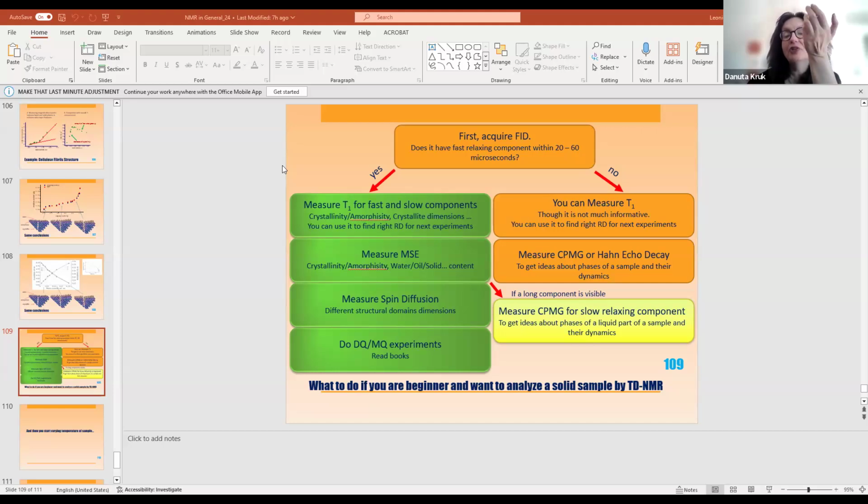But Adriana, we are talking about the deuterated fluoroaniline. So you have only one hydrogen atom per molecule and one fluorine atom per molecule. And they are in pretty symmetrical positions. And you have exponential T1 and double exponential T2.